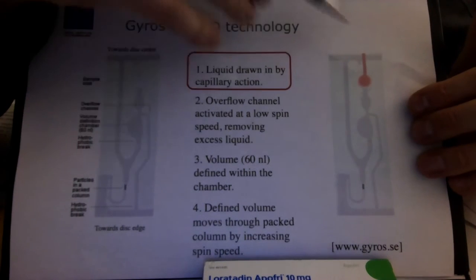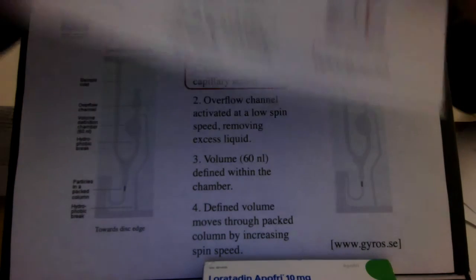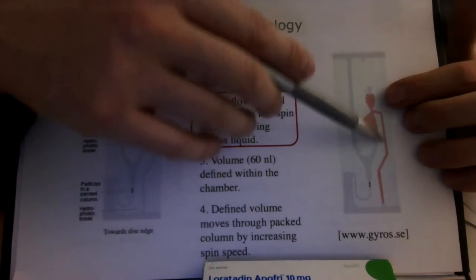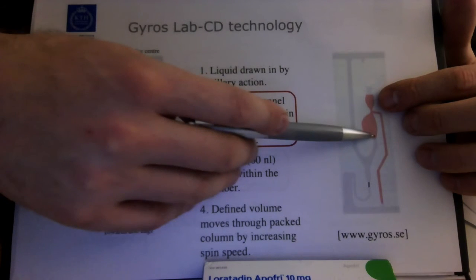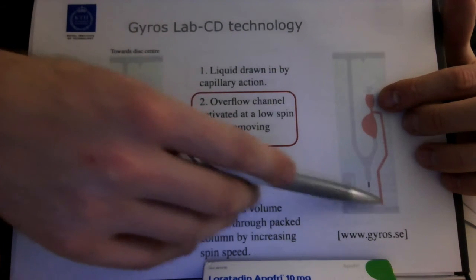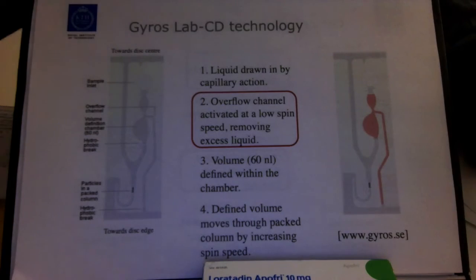So we start with adding liquid to the system, and the first thing that happens is that this liquid will fill capillarily. It will run down, it will run everywhere where it can, which means it will run here and it will run here. It will stop here because I have a hydrophobic valve here. But the system will run here and it will stop here also because there's a geometrical valve. So this is after I fill the liquid, it looks something like this.